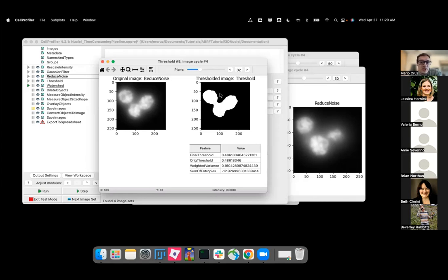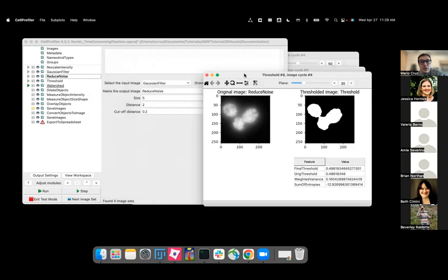So this image just has 2 pieces of information, 1 for the white and 0 for the black portion of your image.